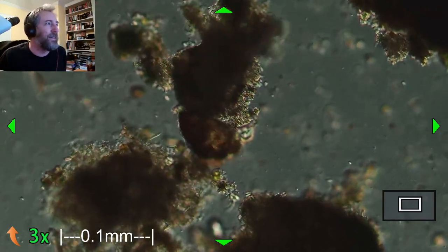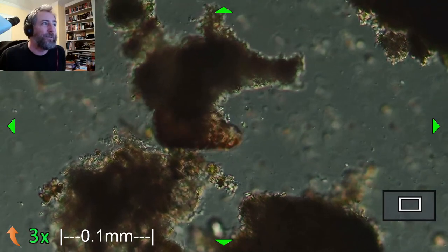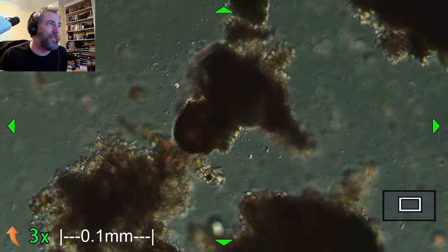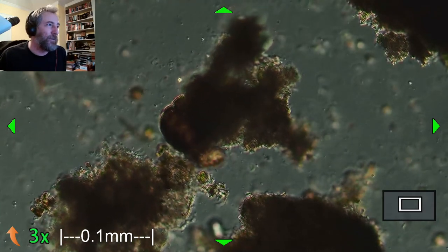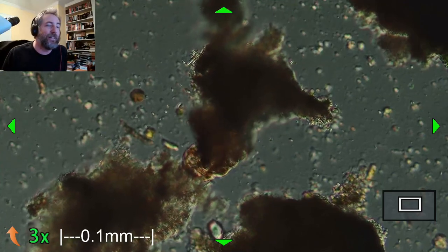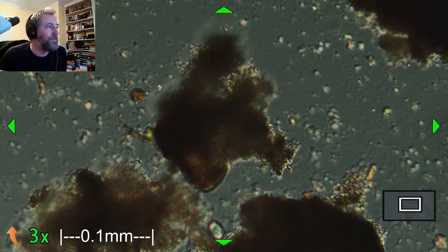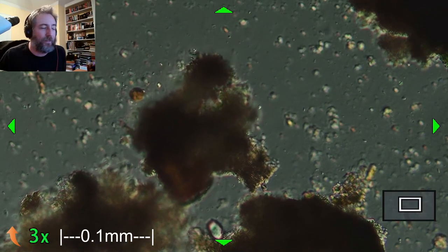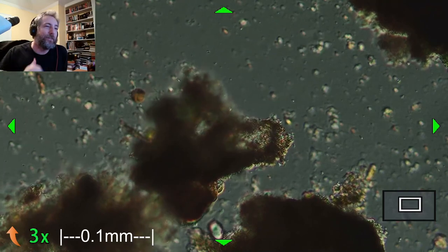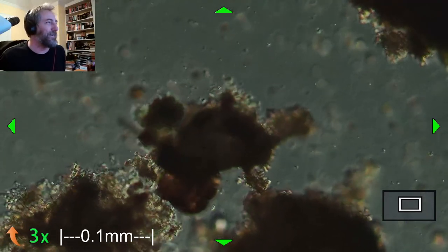And even in the case of, you know, if you baked it in a lasagna in your oven at 350, they would only be able to survive under those conditions if they were in their encysted state, if they were dehydrated. And so if they were crawling around like this, they would die if you got the temperatures up in the 70 degrees Celsius range. So they definitely couldn't handle anything up there. But in their tun state, in their encysted state or dried out state, it's a cryptobiotic state really, they can handle those sort of temperatures. Probably not, if it was baked into a lasagna at 350 degrees, it probably would kill it after the first hour. So if you were doing one of those long baked lasagnas, it probably wouldn't survive.